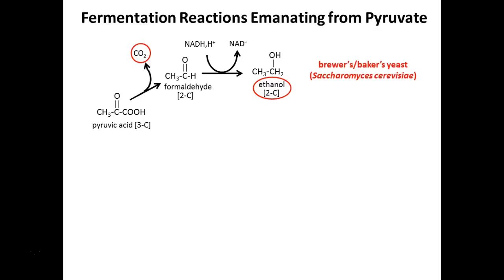So your good old Saccharomyces does this, baker's yeast or brewer's yeast. This is what will convert the sugars that you give it, and this is beneficial for producing alcohol. One of the things it'll also sometimes produce, other than the alcohol, is, what did we see in our tubes? What was the bubble? Gas. And that's actually what helps your bread rise, the production of that gas.